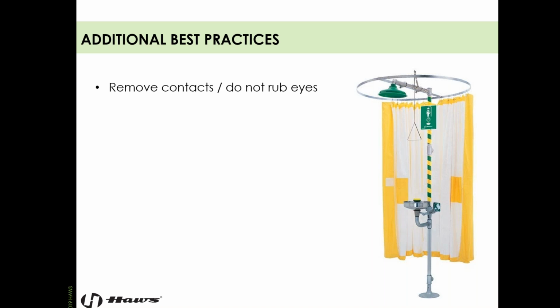Some additional best practices: take your contacts out, very important. They'll trap contaminants. Don't touch your eyes. Disrobe completely, including your socks and shoes.